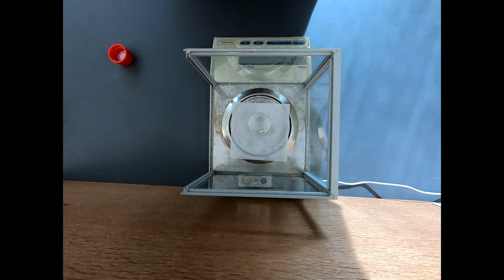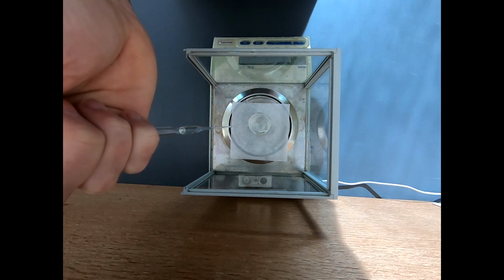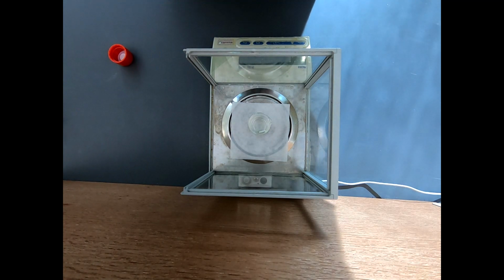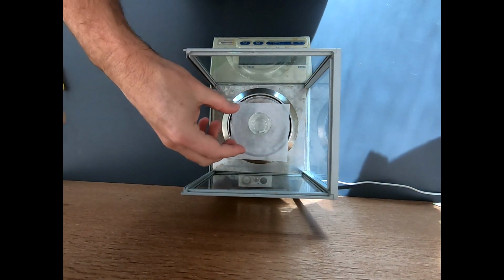Okay, that's already 5.8. We're getting close. Let's get, so 5.11, I'm sorry, 6.11. Better slow it down. Oh, that is 6.110. Look at that. Okay, 6.11. Fantastic. You know, that might have been a little lucky, but that's okay.